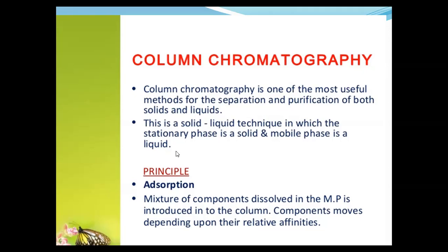Next, when we have a stationary phase as a solid, the working principle, or working mechanism, depends on adsorption. So what is adsorption? Adsorption is nothing but the concentration of solute or adsorbate molecules on the surface of an adsorbent. So here in this technique, the adsorbent is our solid and the adsorbates are our analytes or sample.